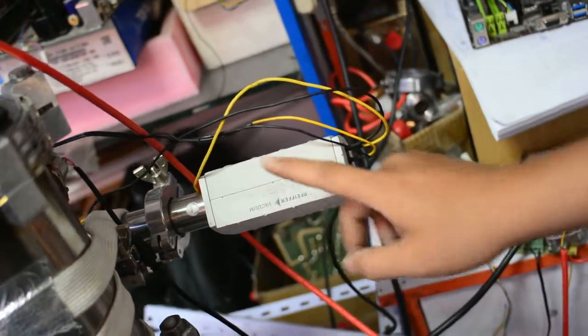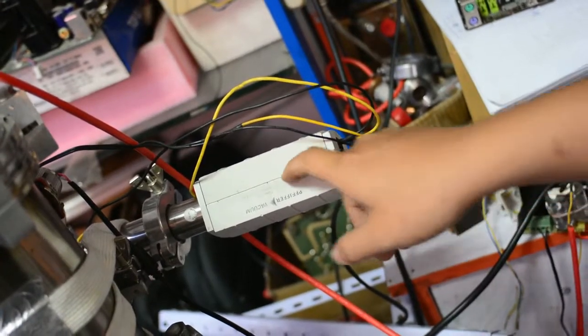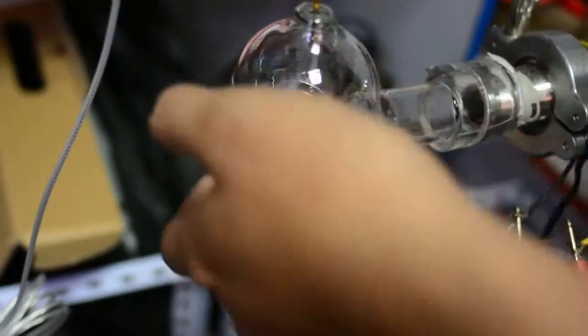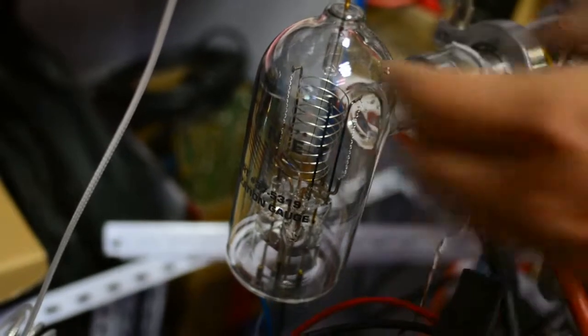It is made with an iridium filament. This other one is a traditional ion gauge that measures high vacuum with a tungsten filament. I'm not using it very much because of the filament material.